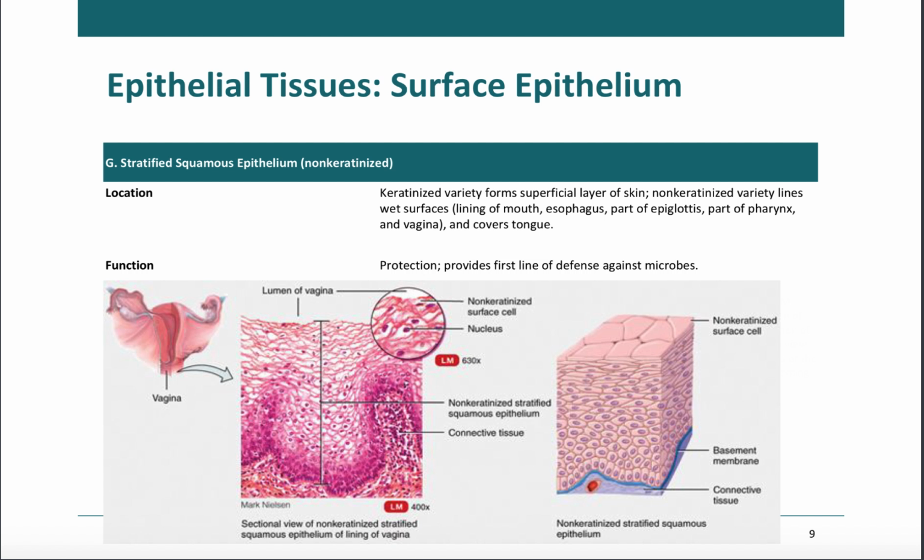Now let's go into the weirdest guy, stratified squamous. And stratified squamous often gets confused with smooth muscle and with transitional, okay? So, this is an example of what's called non-keratinized, meaning keratinized is found on the skin. This is layers and layers of squamous tissue elsewhere. Now, here's the big thing. Notice these cells all look like they're squashed. They all look like someone was a circle and then they all got sat on.